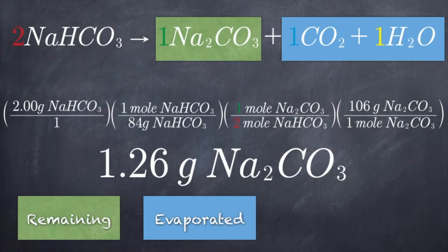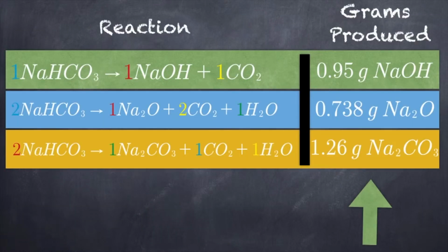So students were trying to identify which one of these 3 reactions was the true decomposition reaction of baking soda, and all they had to do was heat this up and record the mass of each one of these 2 grams of heated baking soda, and it would convert to a new substance.